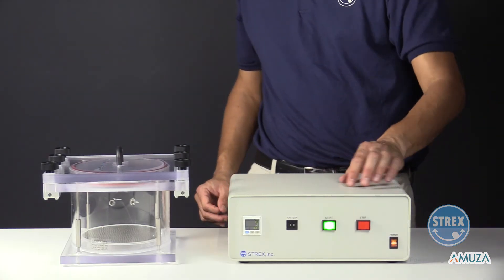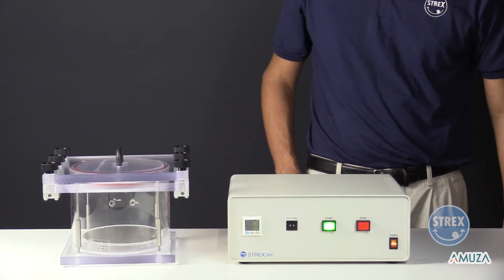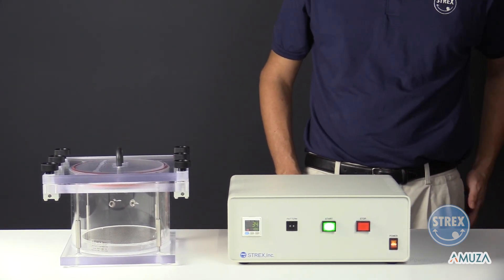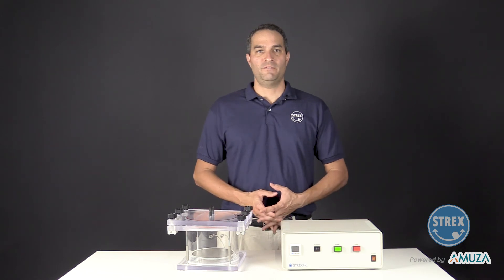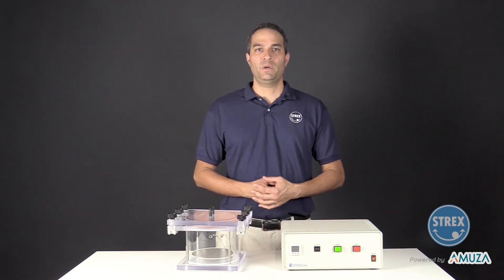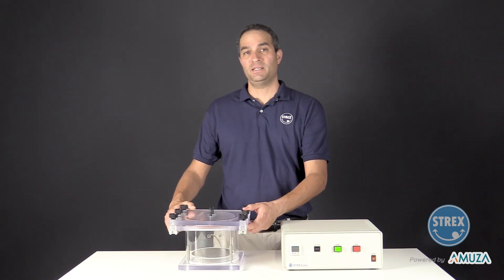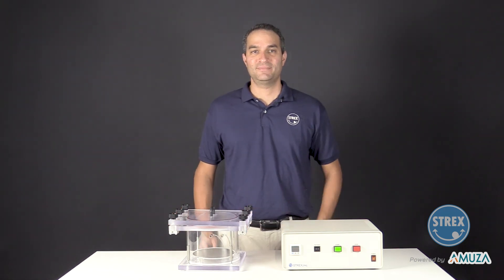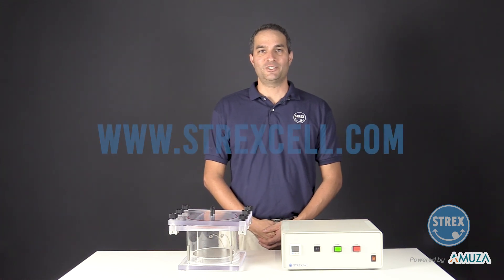Pressure range can range from 0 to 250 millimeters mercury for a standard model, but we can accommodate custom systems for higher pressures. Each standard chamber can fit up to six plates, but we can also expand the system to have up to two chambers simultaneously for higher throughput. Contact us today to find out how our system can help you with your research.